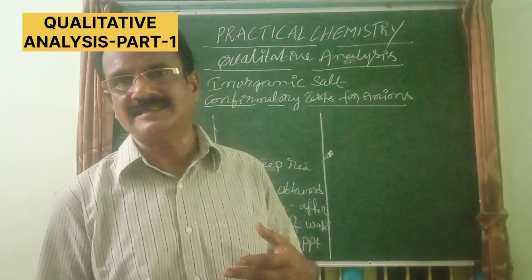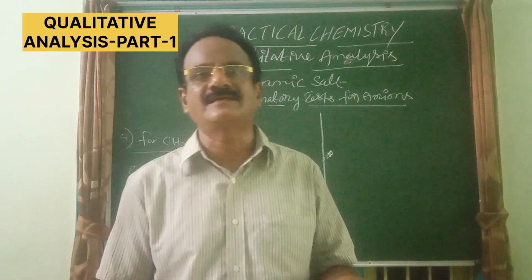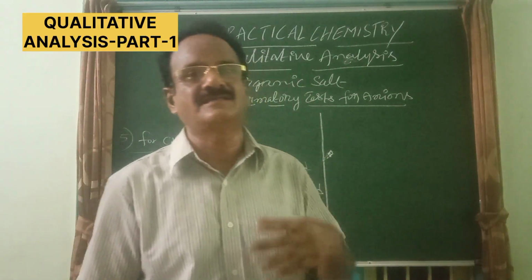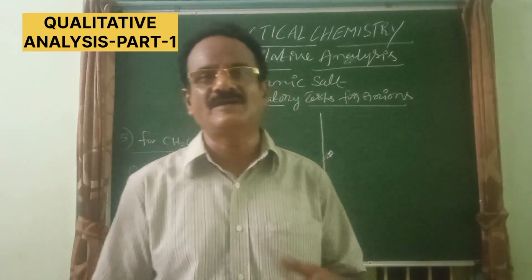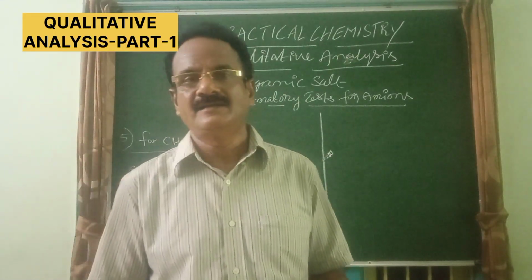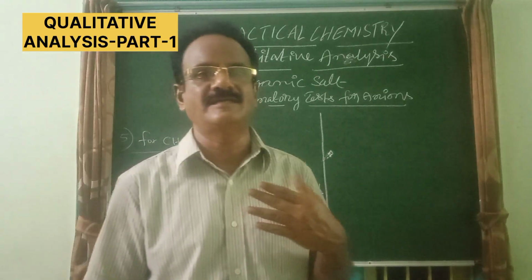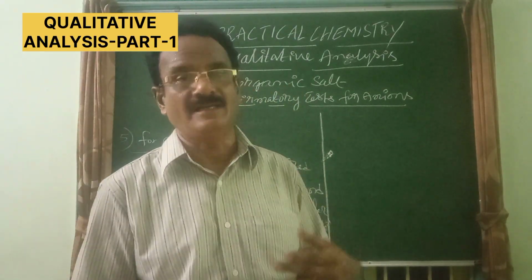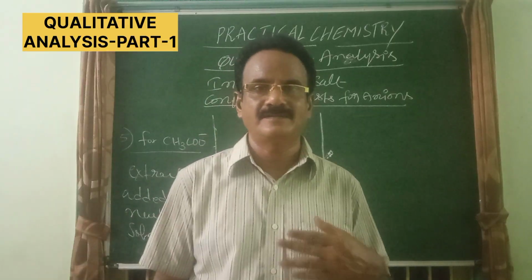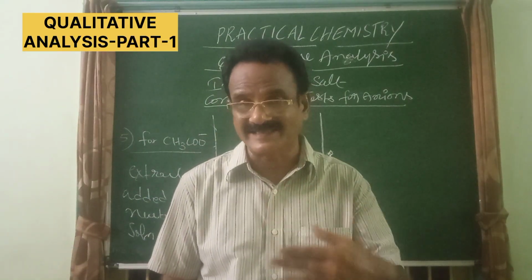Another test is the oxalic acid test. If you rub the salt along with oxalic acid, it gives vinegar smell, because of formation of acetic acid. Okay, if the salt contains acetate and you rub that salt with oxalic acid, you can get vinegar smell. That is due to the formation of acetic acid.